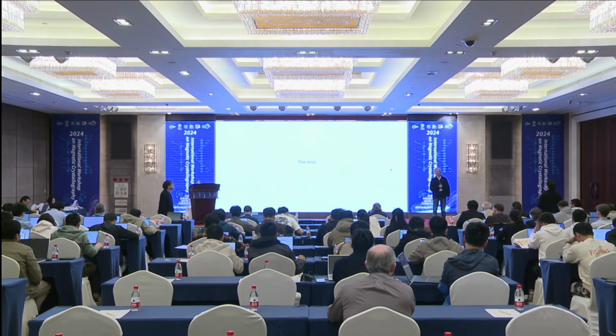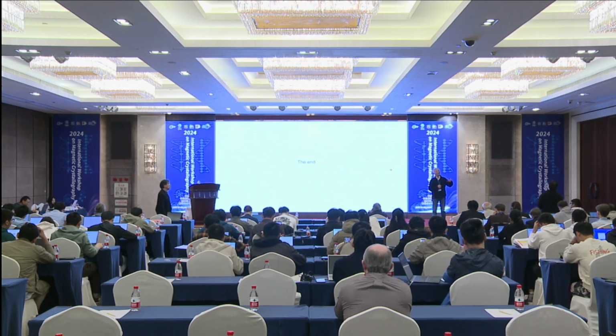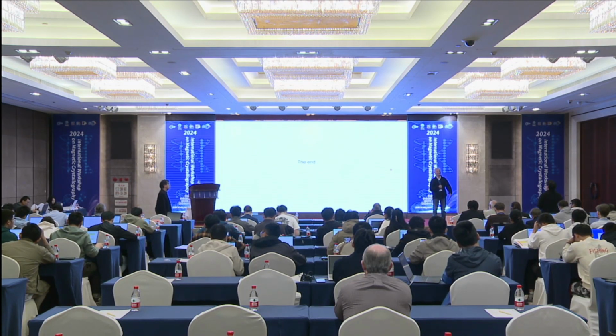So this also can be a different case, with a different unit cell dimension, but you need to use a different phase in GSAS. Okay, thank you.